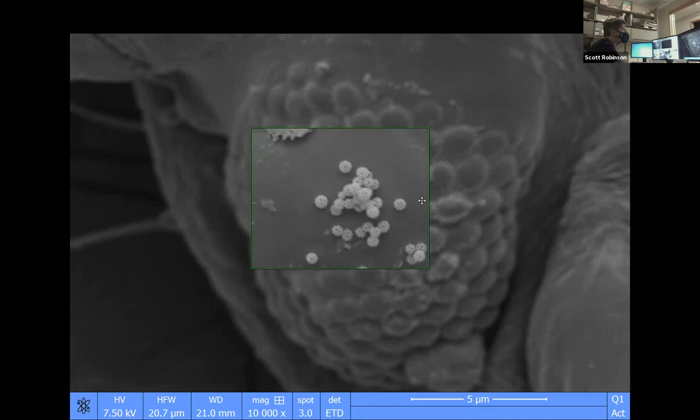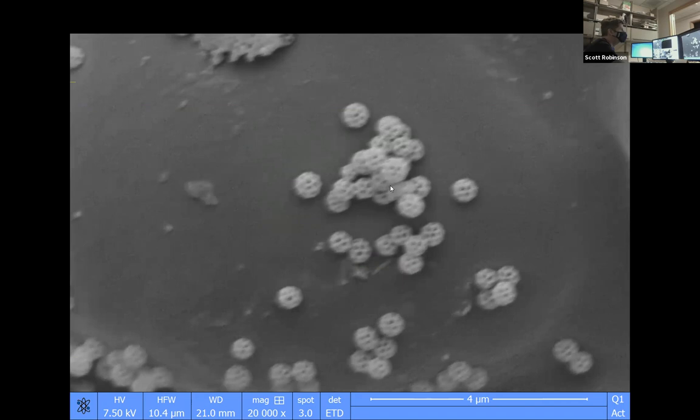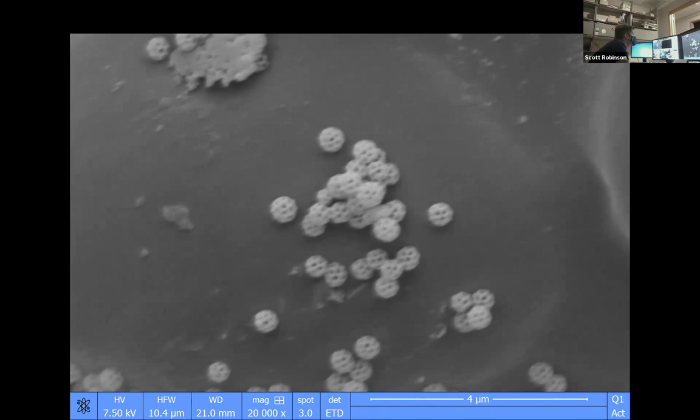That looks better. There's so much beam energy hitting the sample that the sample sometimes will look like it's moving. It is kind of shrinking a little bit when the electron beam hits it. So let's go find this.